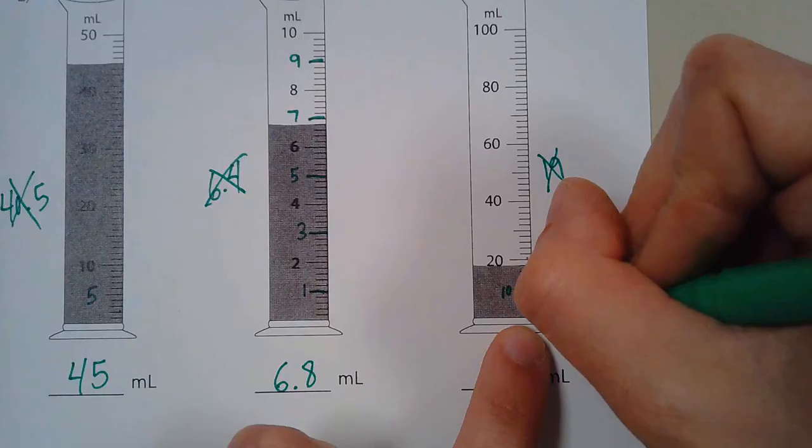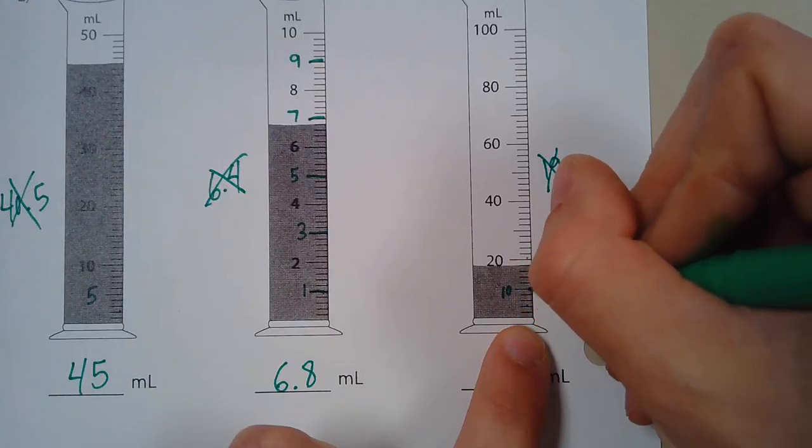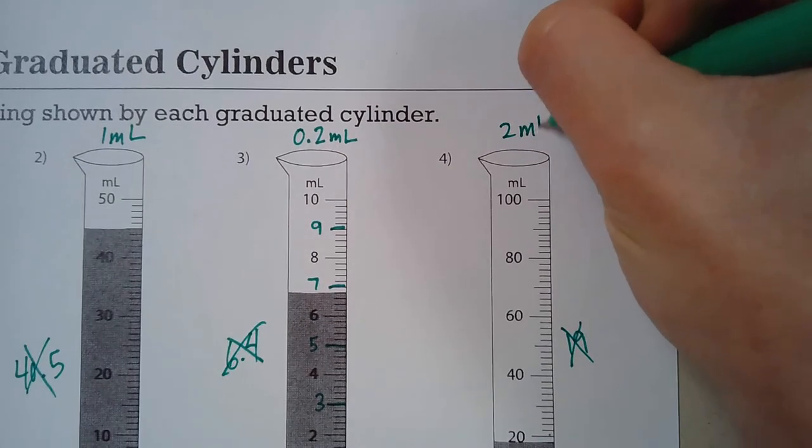And so if we try by 2s, 2, 4, 6, 8, 10, that is the correct scale.